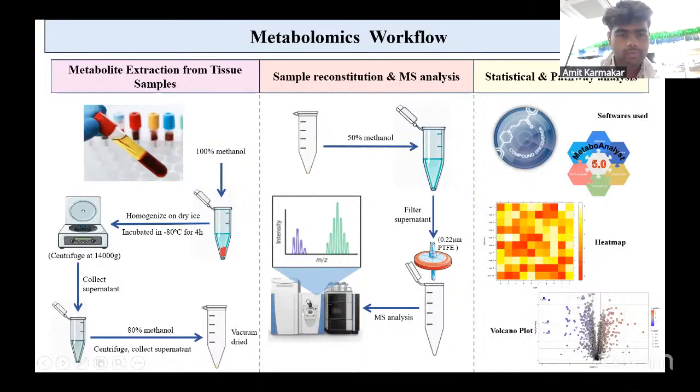So today, as Amrita has just said about surface proteomics, I'm going to talk about how to process metabolomics and lipidomics samples from serum. Our lab is not only subjected to proteomics. We are also exploring different small molecules using complex metabolomics and lipidomics workflows. Today we are going to show how we can separate the metabolites and the lipids from the serum samples. First, coming to metabolomics.